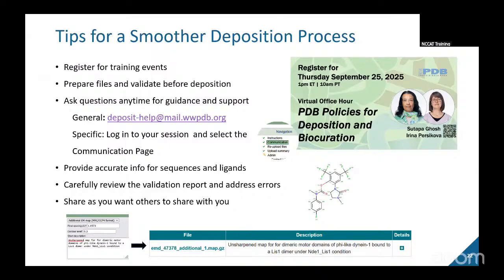When we're submitting a structure for review these days, the structure and the maps go to reviewers. And certainly as a reviewer myself, I would try to improve things, to identify errors, and hopefully the author will correct those errors. If that requires withdrawing and redepositing an existing structure, well, it would be obsoleted, it's not withdrawal. Right, I guess you get where I'm coming from.